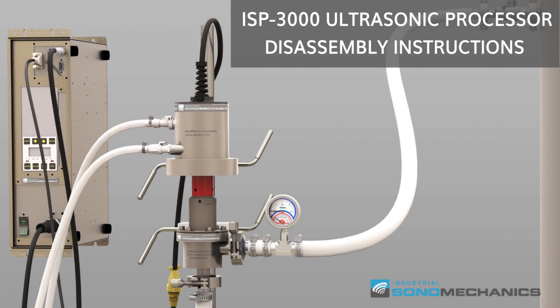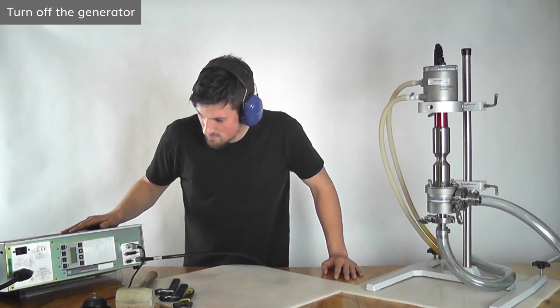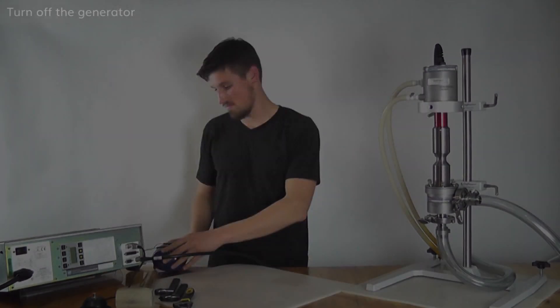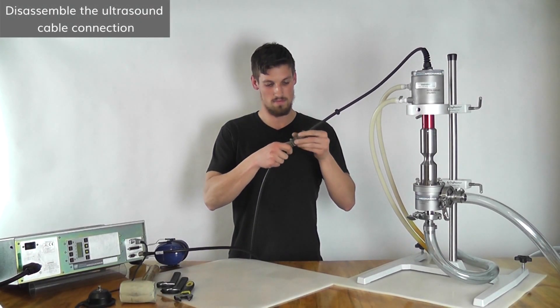In this video we are going to show you how to disassemble the ISP3000 ultrasonic processor configured in the flow-through mode. To begin the disassembly, make sure the ultrasonic processor is turned off. Next, disassemble the ultrasound cable connection.